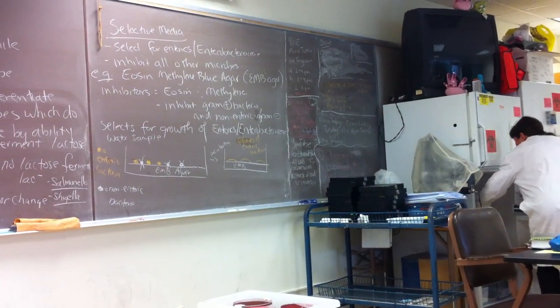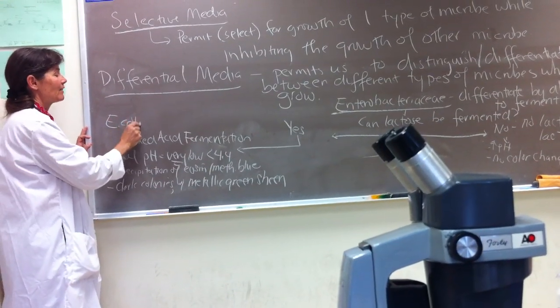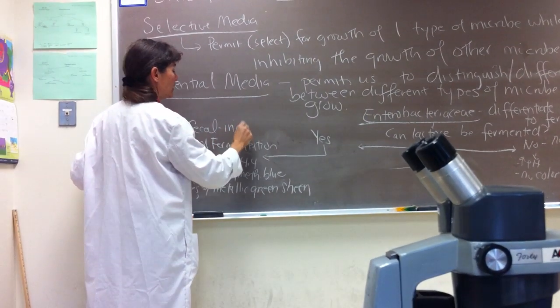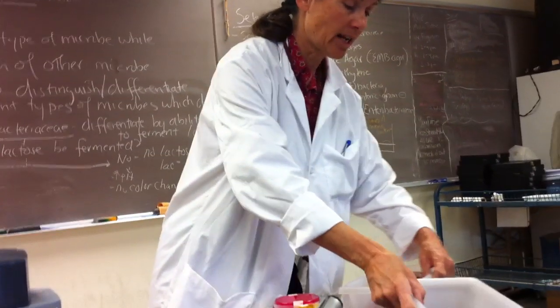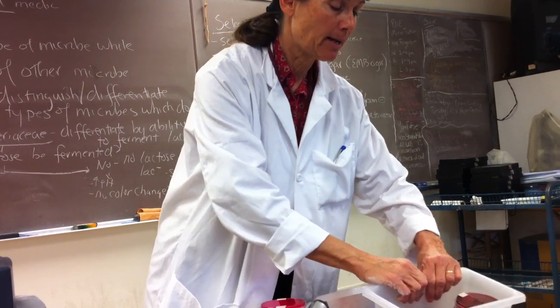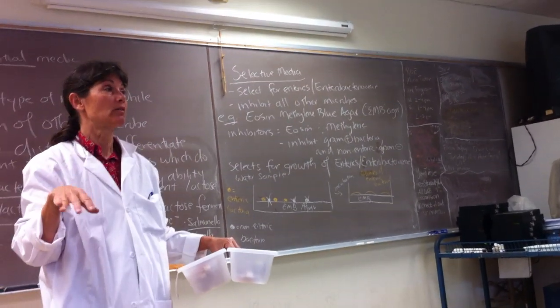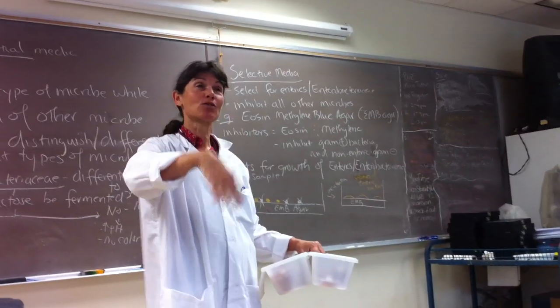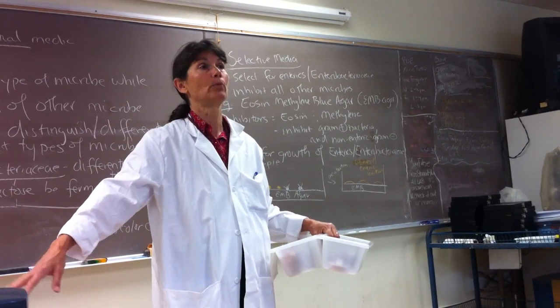The microbe that we classically think of as carrying out this mixed acid fermentation is our fecal indicator, E. coli. So remember, this is our indicator of fecal contamination. So if we plated well water samples on Eosin methylene blue and incubated them, and when we pulled them out of the incubator the next day, they were covered in these dark metallic green colonies, we won't panic, right? We're professionals. But we're like, oh no, this well water is potentially contaminated with feces, and we need to tell the families using it to stop using it, or boil it.